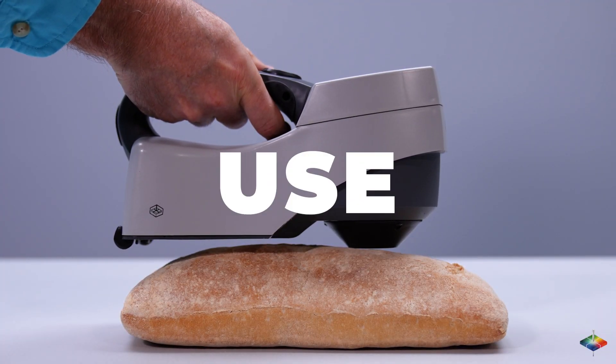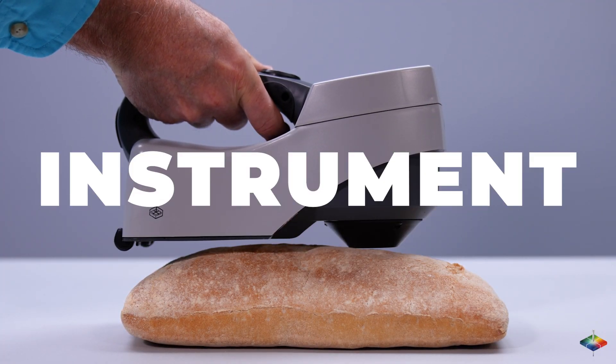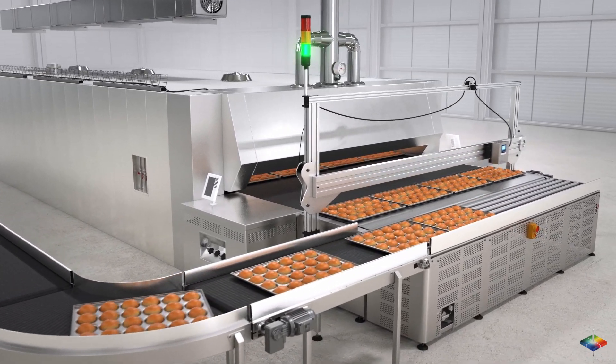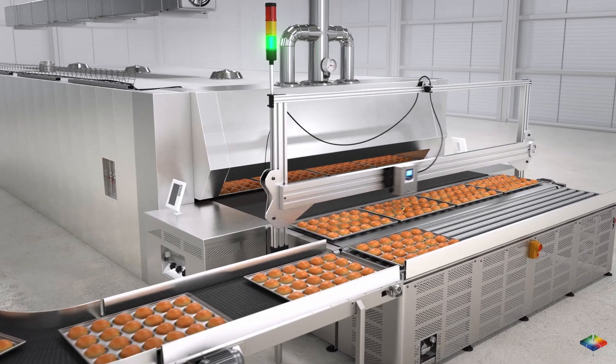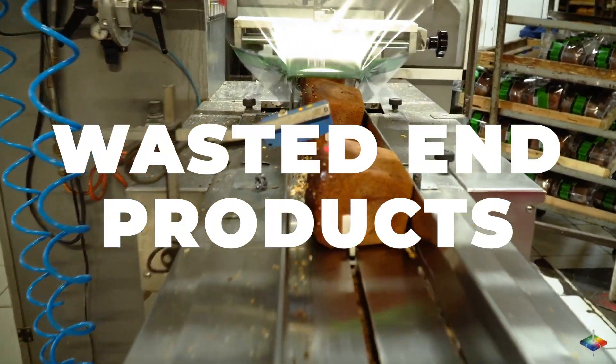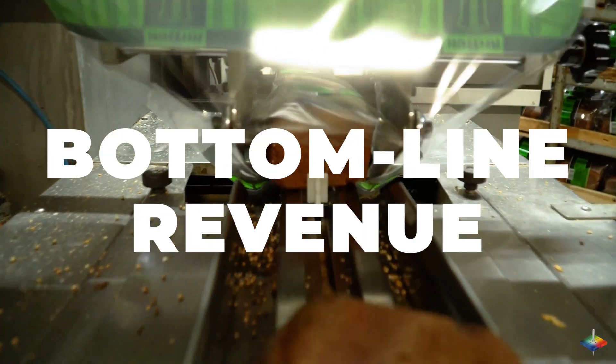Take advantage of an easy-to-use, reliable color measurement instrument to provide early warning signals and ensure your quality control processes work seamlessly. Hunter Lab spectrophotometers thus help reduce wasted end products and improve your bottom line revenue.